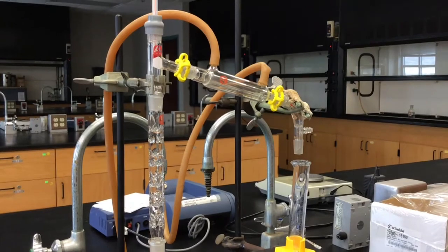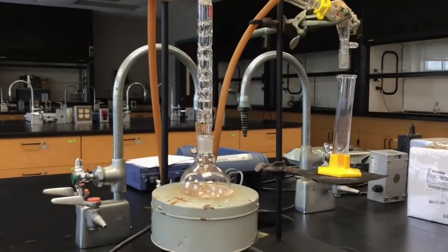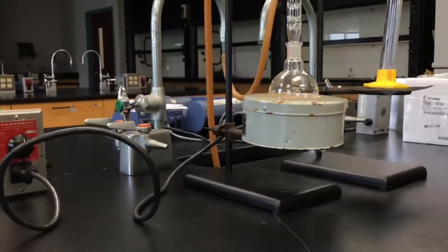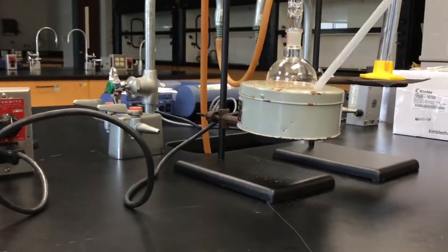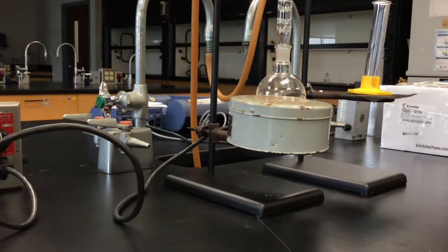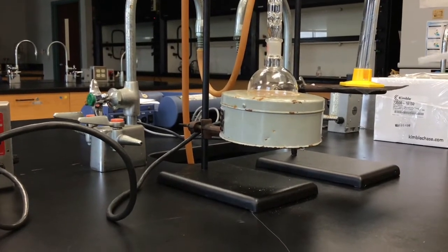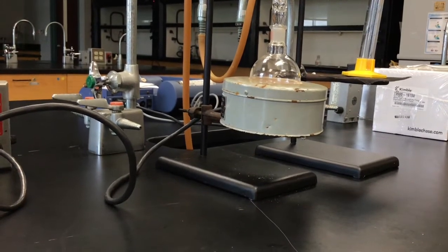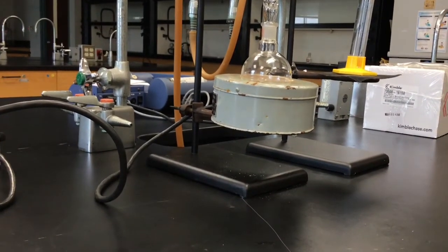The last piece I said was this one here. It would normally go right here, but the reason I left it off is because there's one more thing you need to consider. You need to make sure that you have a way to get this and this separate from the rest of the apparatus easily because first you will assemble the apparatus before you put the stuff on the inside. So you need to have a quick way to drop it out, put your stuff in, put your boiling chips in, and then put it back together. So that will be here.